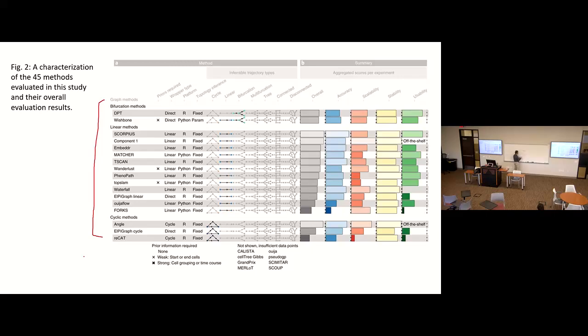So the location of those subclusters by t-SNE and UMAP are not fixed. They are randomly populated. When you run the algorithm, it could be here, and next time it could be regenerated in this location here.